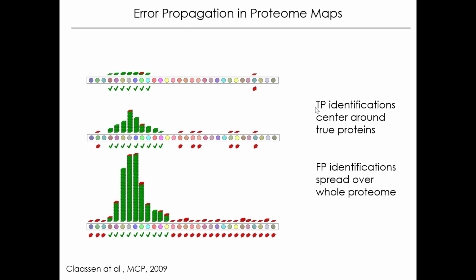So I mentioned at the beginning the two studies with these proteome draft papers, and I said that they overestimated from the data the number of proteins that were probably truly in the sample. So we analyzed this effect, and it is an effect that I think is now fairly well understood. And Manfred Claassen, who was at the time a PhD student in our group, eventually wrote a program that should correct for this.